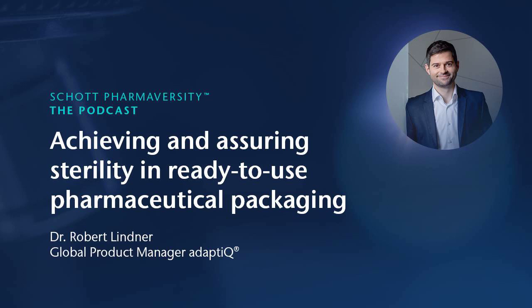So, directly to start, Robert, sterility is a topic that is highly relevant. To start with a joint understanding of this topic, can you please let us know if sterility is a binary parameter, so sterile or unsterile, or how would you say it is defined?